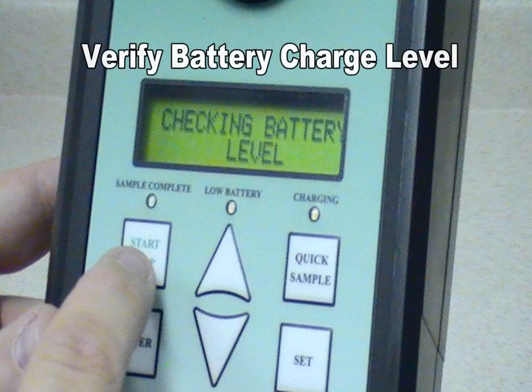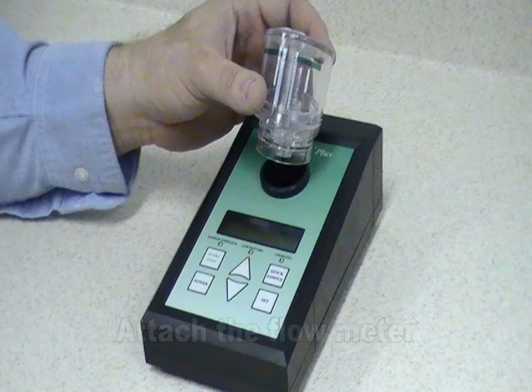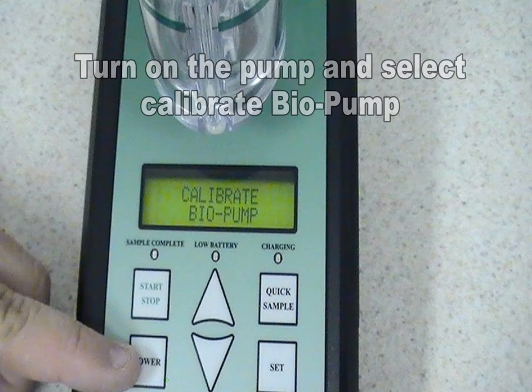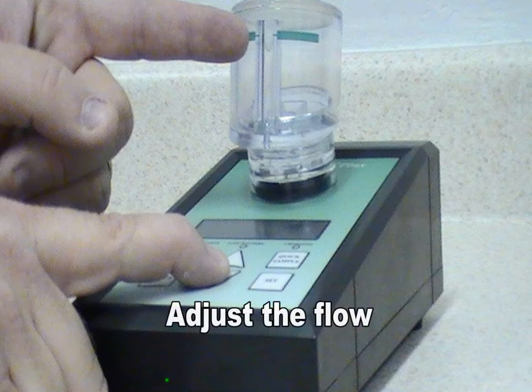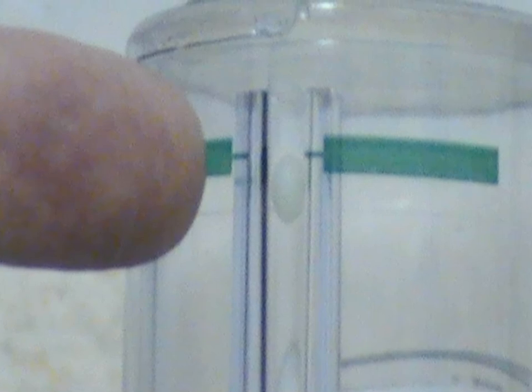To use the Biopump, first verify the battery charge level, then attach the Aerosel Flow Meter to the top of the pump for calibration. Turn on the pump and select Calibrate Biopump. Adjust the flow of the pump with the up and down arrows until the BB in the flow meter is centered in the green lines to verify 15 liters per minute.